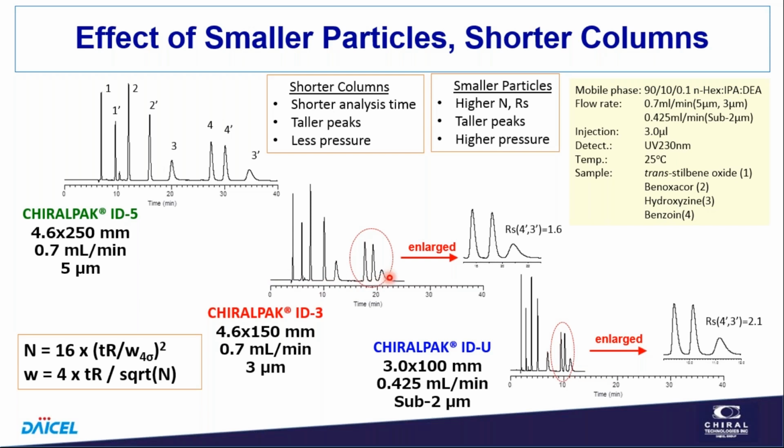I want to point this out. This illustrates two things. One is this isn't just a change from particle size. This, I think, is probably just a lot-to-lot variability. And we'll discuss this, and we do this in achiral chromatography too. We'll use multiple lots in part of our validation, different lots of stationary phase.